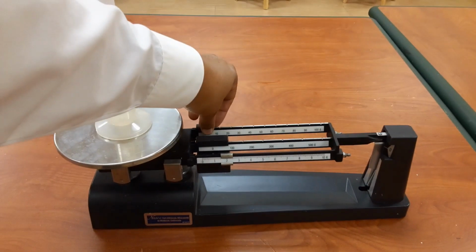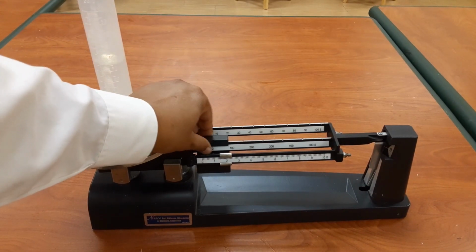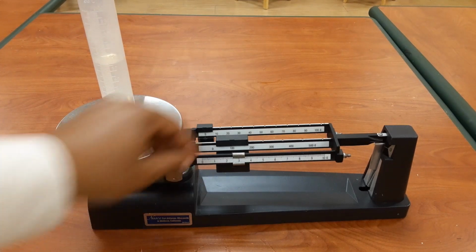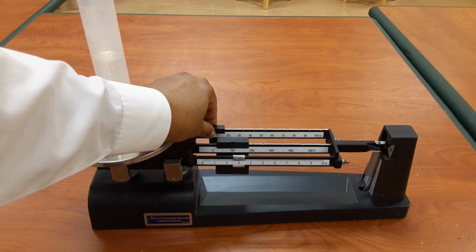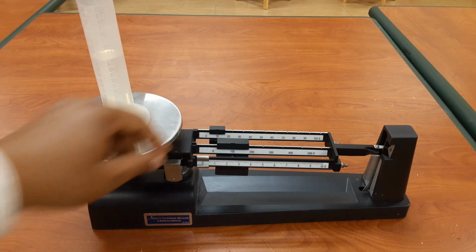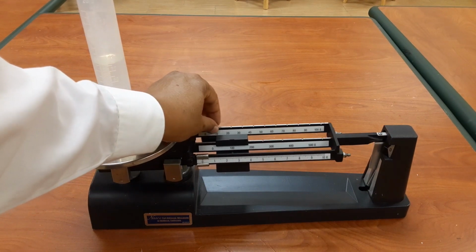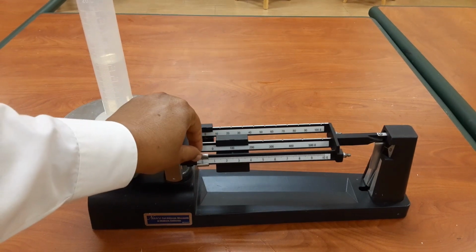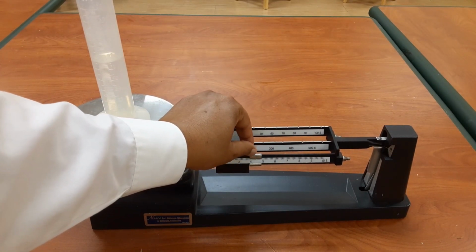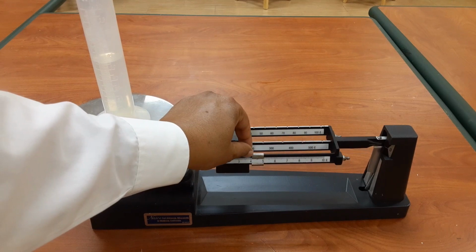So let me pull this back and move this big slider over to 100. And now I have three sliders working together. When I move the slider on the back beam, it's dipping. So the mass is somewhere between 100 and 110. So I will now adjust the smallest slider until the beams are horizontal.